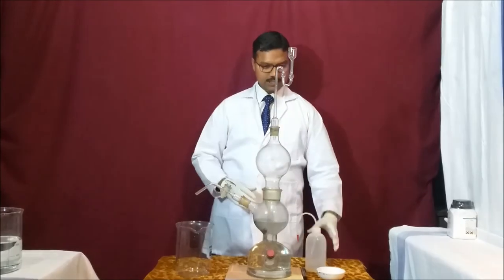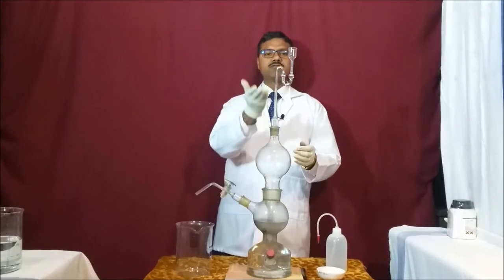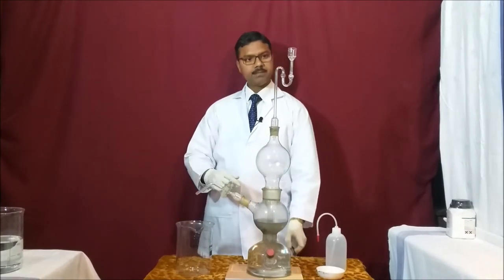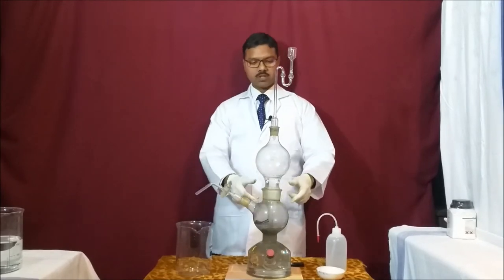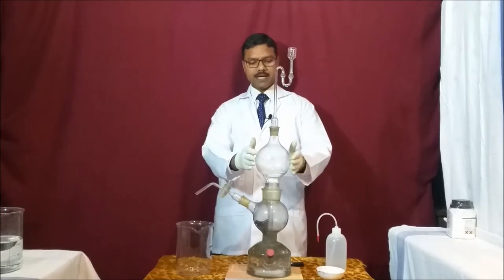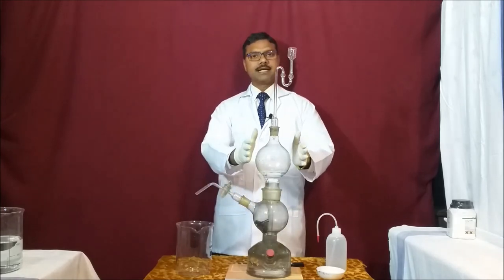After fixing the thistle funnel into the system to stop excess gas from escaping, I am introducing a few drops of distilled water here so that gas will not come out through chamber A. Now I am closing the knob, and you can see a good amount of gas is being produced. When gas forms, the solution goes down and this chamber fills with gas. Hydrogen sulfide gas is being made here, and the excess acid goes back into chamber A.